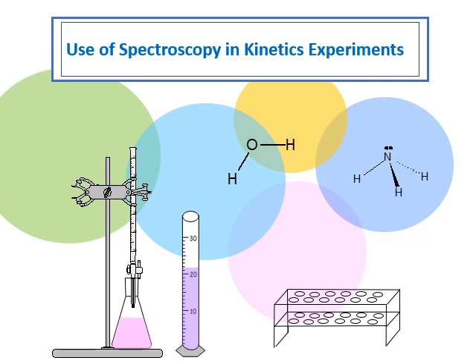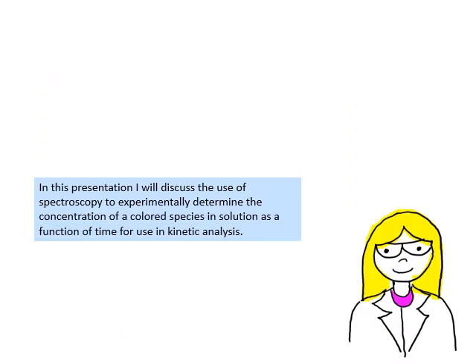The topic of this presentation is the use of spectroscopy in kinetics experiments. In this presentation, I will discuss the use of spectroscopy to experimentally determine the concentration of a colored species in a solution as a function of time for use in kinetic analysis.